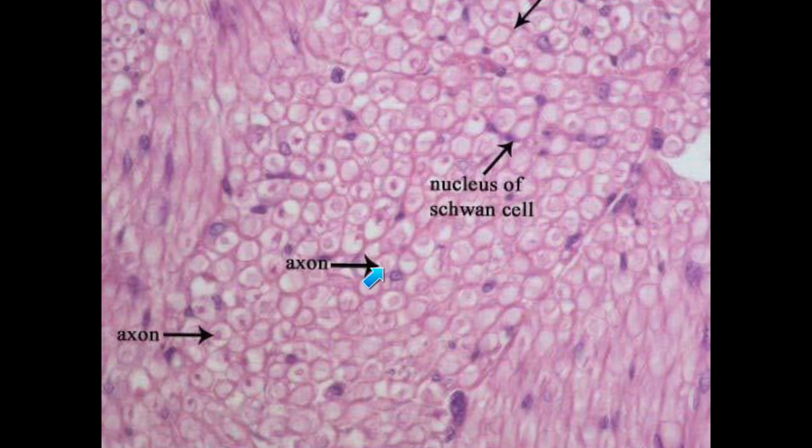If you have a label for the white area, it is the site of the myelin sheath which dissolved during preparation of the section. If you are asked what is now present in this area, you can answer neurokeratin.